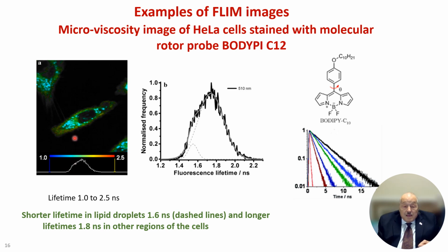And these bright spots are a shorter lifetime than the other spots on the cell. So basically, I guess I didn't magnify that image quite enough.